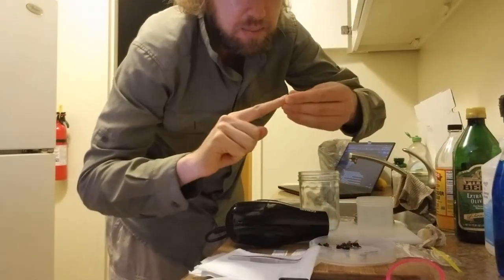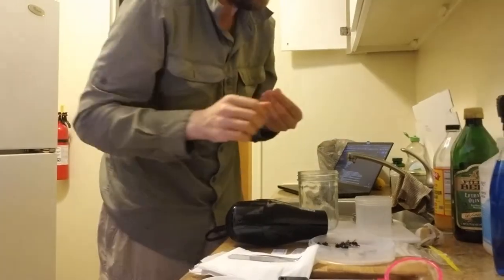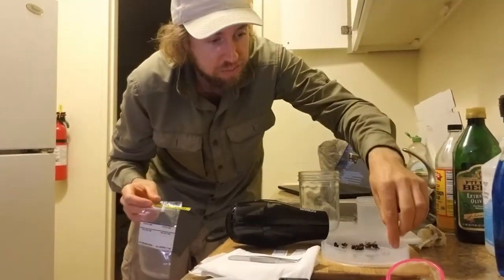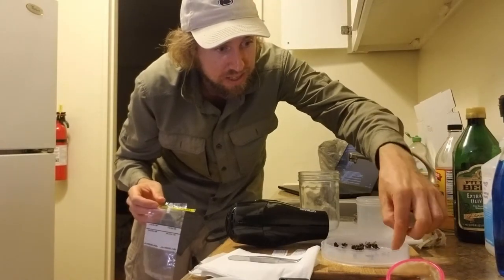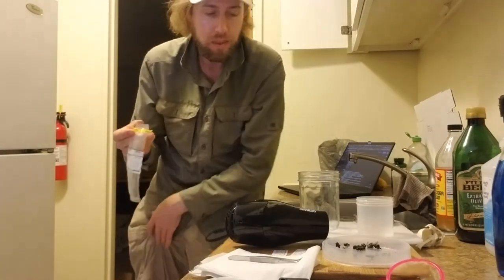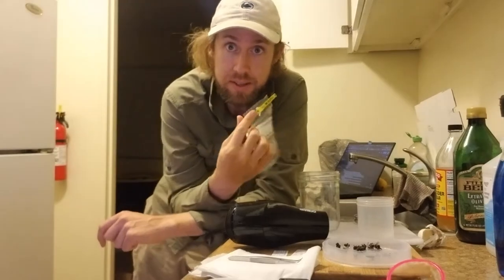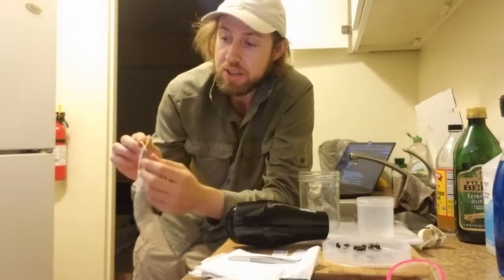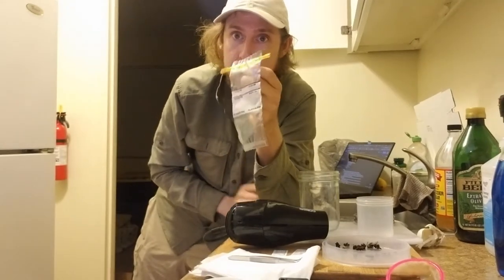When using traps you'll normally end up with more bycatch, but in this case there's not much because I was using a net. All of that bycatch we want to keep — those are insects that died and we want to make sure they might be useful to someone in the future, so we use these whorl packs.